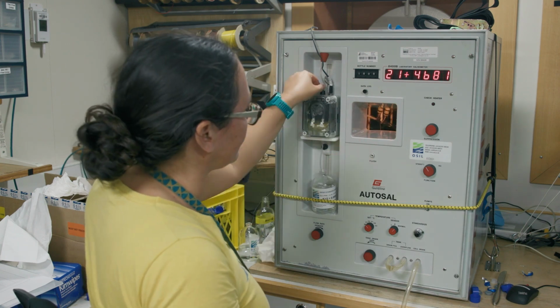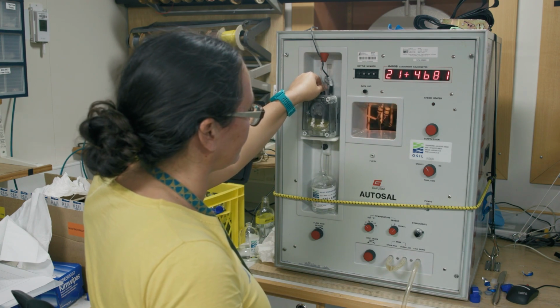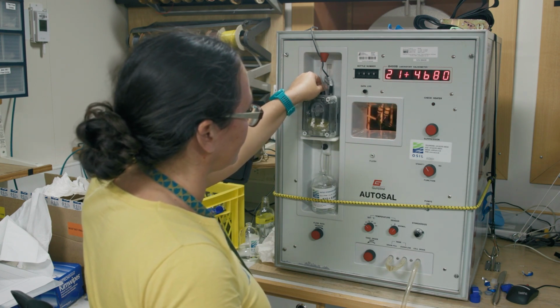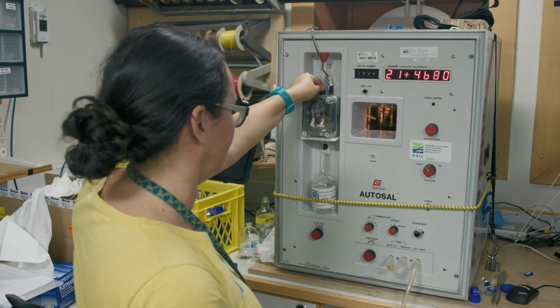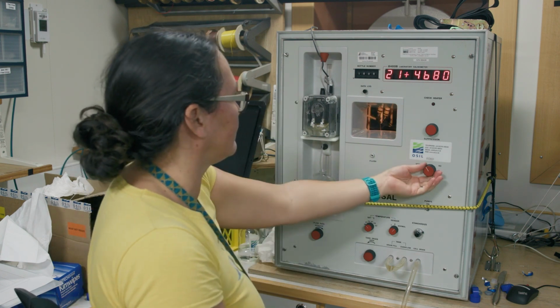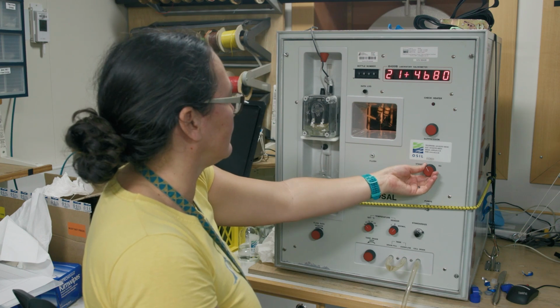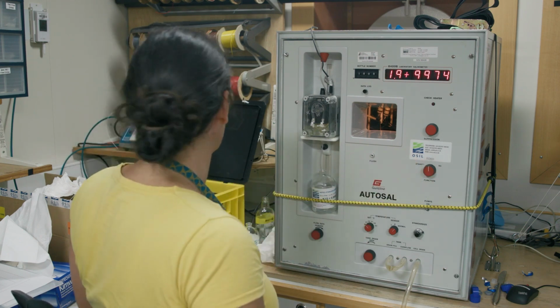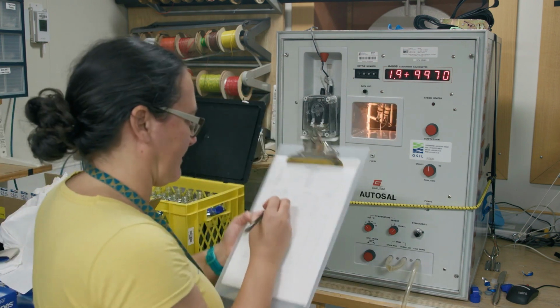Then switch off the peristaltic pump. Wait a few seconds and check that the lamps in the bath are switching off and on to indicate that the sample in the cell is the right temperature. It's not needing to be uniformly heated or allowed to cool. Then you can switch the function knob to read and wait a few seconds for the displayed number to stabilize. This should stabilize in much fewer than 10 seconds.